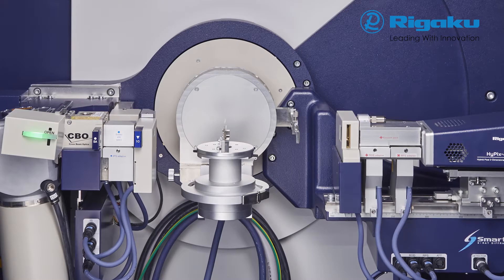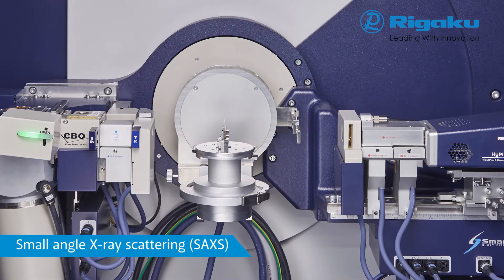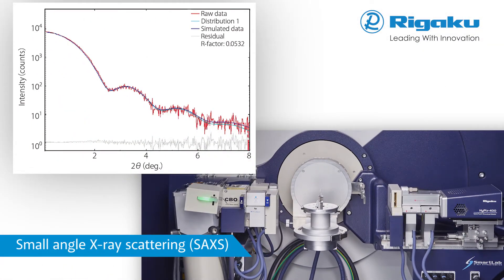Small angle X-ray scattering reveals particle size or pore size less than 100 nanometres in diameter. SmartLab SE has a special alignment of the incident slit to minimize parasitic scattering, delivering a superior profile with a high signal-to-noise ratio.